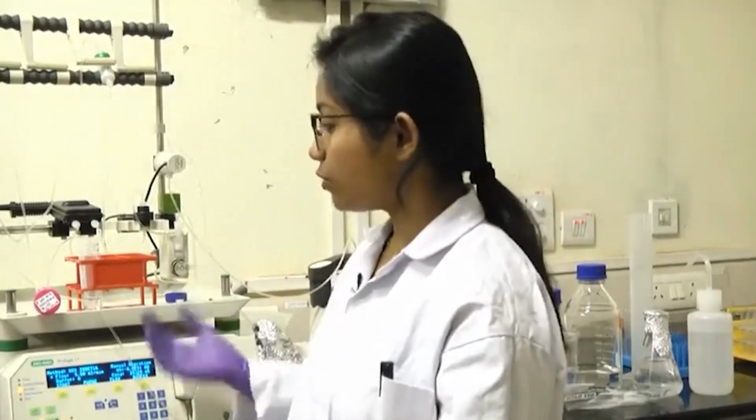Also you might need to change the buffer composition depending on the protein. As I mentioned earlier, depending on what kind of protein you are using, you need to add small molecules to stabilize your protein. The buffer system should make your protein as stable as possible in the solution, otherwise your protein will precipitate out and you will not get a pure protein, or you might not be able to purify that protein from the tissue or the source.